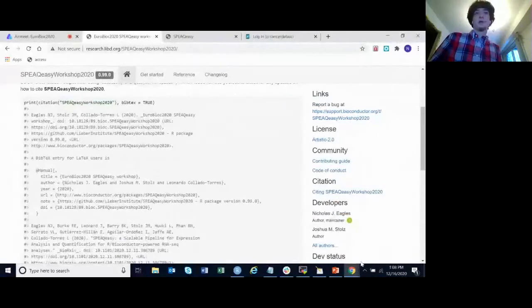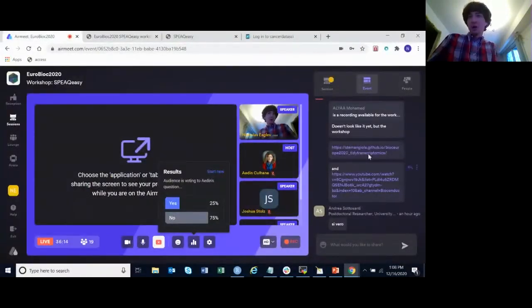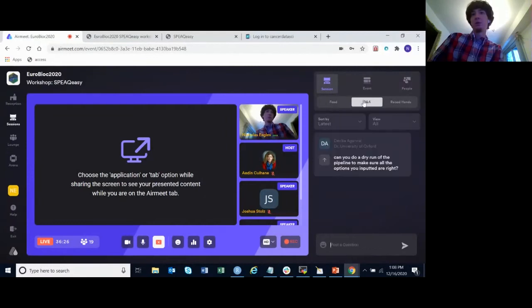Nick. Yeah. We have a question that says, can you do a dry run of the pipeline to make sure all the options are inputted are right? So you click on the Q&A on the top right of your screen, and that's where you can see the question. Can you do a dry run of the pipeline to make sure all the options you inputted are right?